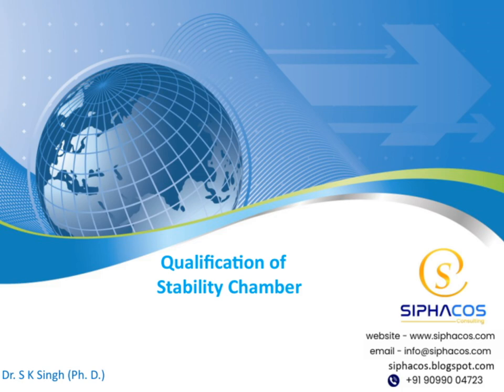Today, we're going to explore the qualifications and standards related to stability chambers. My name is Dr. S.K. Singh, and I hold a PhD in this field. This presentation is titled Qualification of Stability Chamber, and it will guide you through the essential aspects of ensuring these chambers meet quality and regulatory standards. We'll cover the key processes, testing procedures, and best practices to maintain stability chamber performance. So, let's get started and dive into the world of stability chamber qualification.